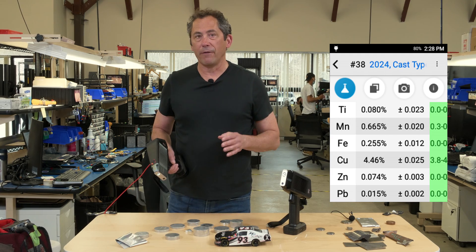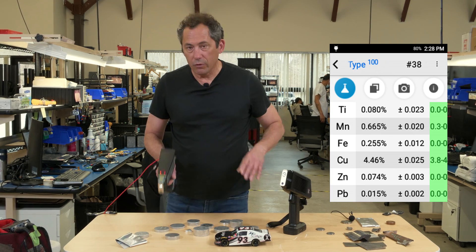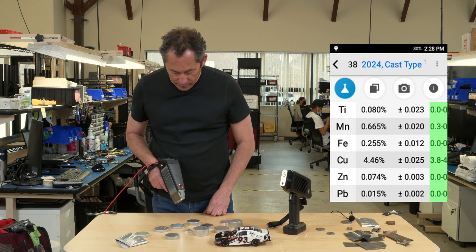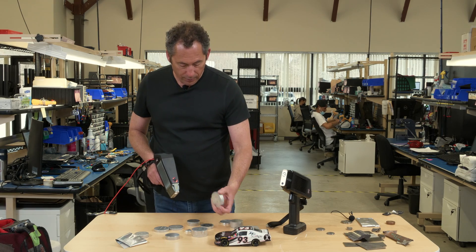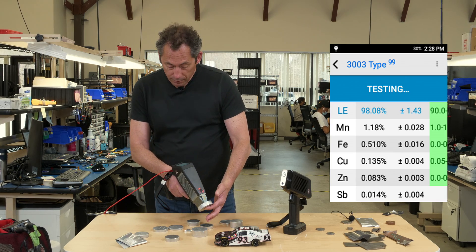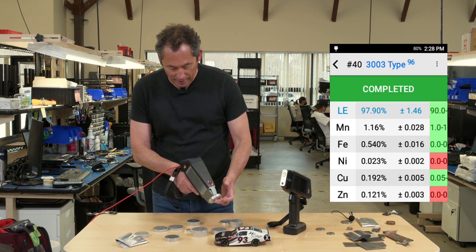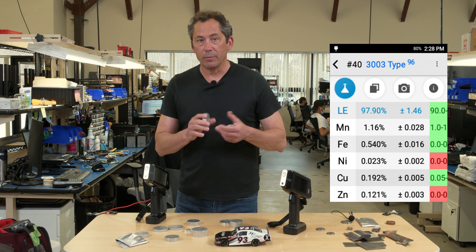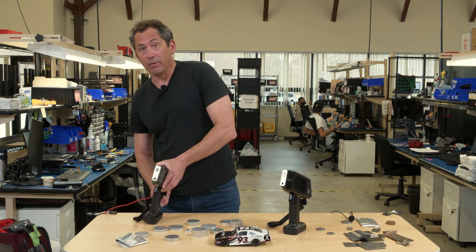That's great if you only encounter a few of the most common aluminum alloys. But notice it says '2024 type' — here's where you get into danger using this very quick and simple method: what happens if you encounter a wider variety of aluminum alloys? For example, here's a 3003 called correctly because of the manganese. But what if you actually encounter a 3005? It still says 3003, because the only difference between a 3003 and a 3005 is magnesium. So unless you measure magnesium, you can't tell these apart.